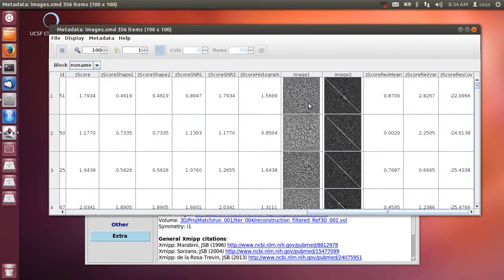In principle, if the image really corresponds to that volume, these residuals will be just noise. It is not white noise because it has been colored by the CTF, but otherwise it is noise. From this colored noise image, we compute the covariance matrix.